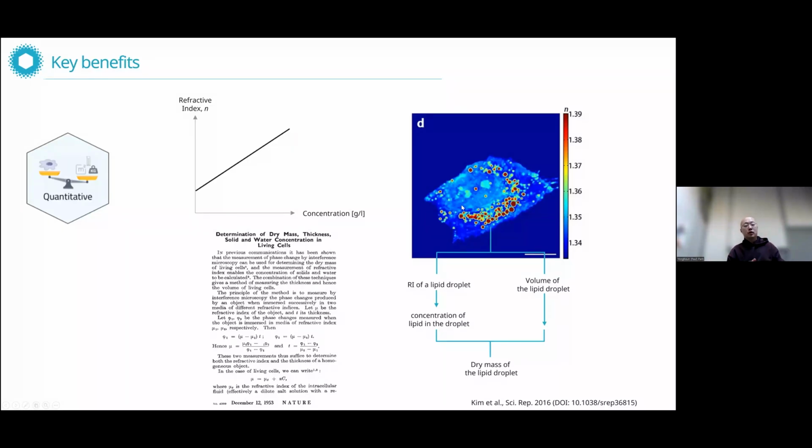So this is not well appreciated in the field, but some of the users have recognized the potential of this feature, so they are applying it to various applications, including phase separation and LLPS, liquid-liquid phase separation, and also bioengineering, where some companies are using bacteria or algae in order to produce highly valuable products such as bioplastic, PHA, something like that. So they were using HT to quantify for various applications.